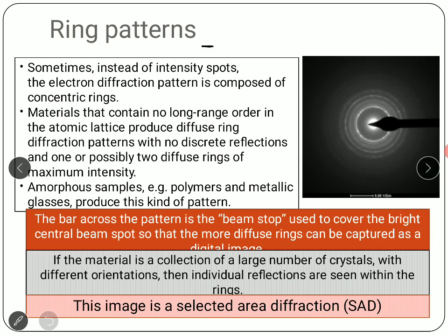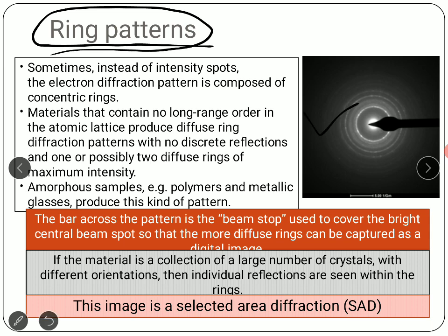If we look into some more research papers, you will see that there is another kind of diffraction pattern which is observed, which looks more or less like a ring. This sample might be a single element, it can be a nanomaterial, or it can be a compound having a combination of different kinds of material, and based on this we'll be getting these diffused rings. So this actually points to a different thing altogether.